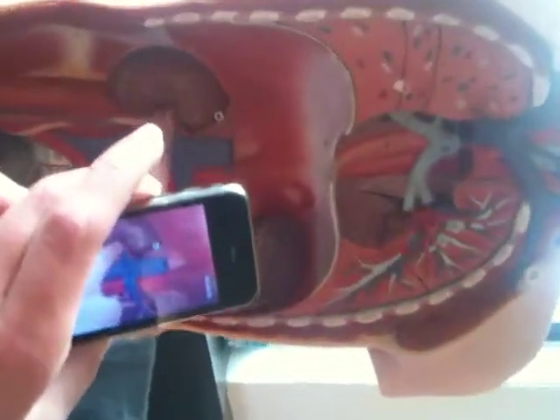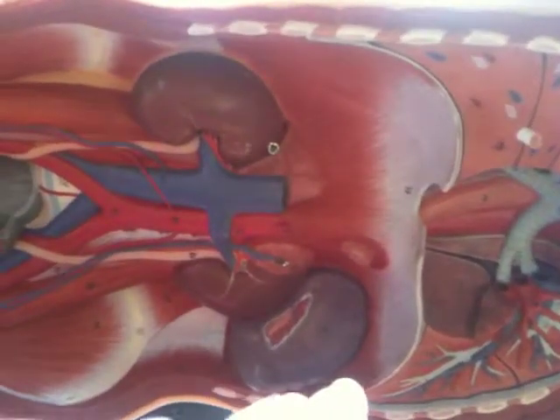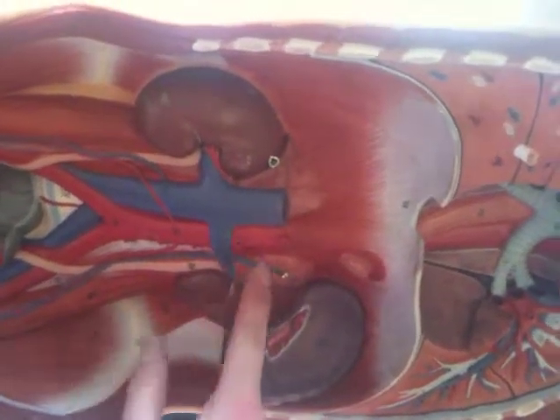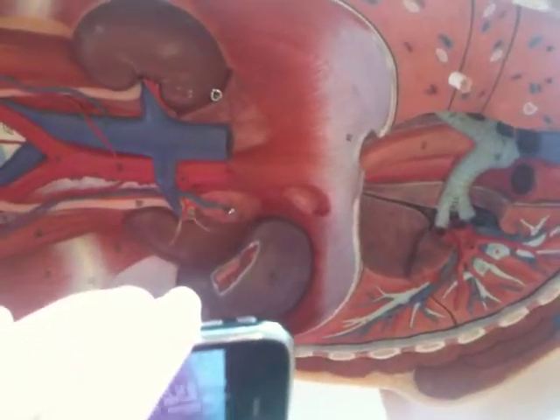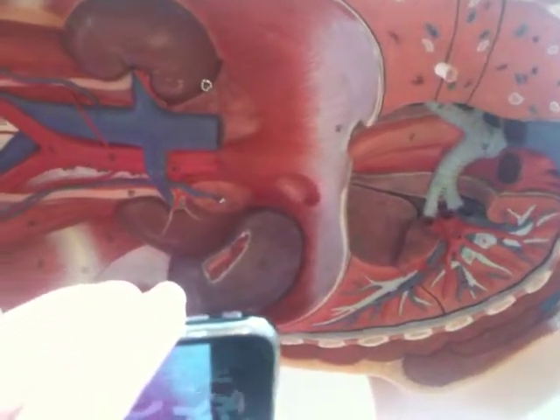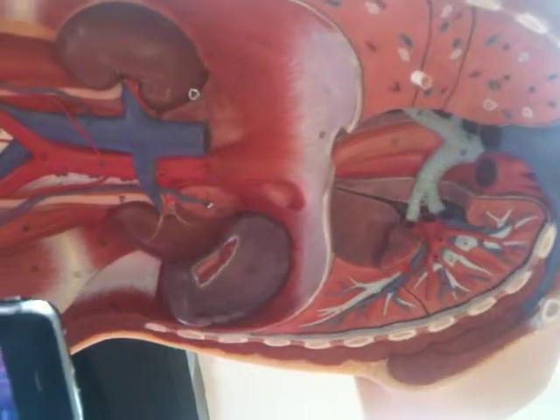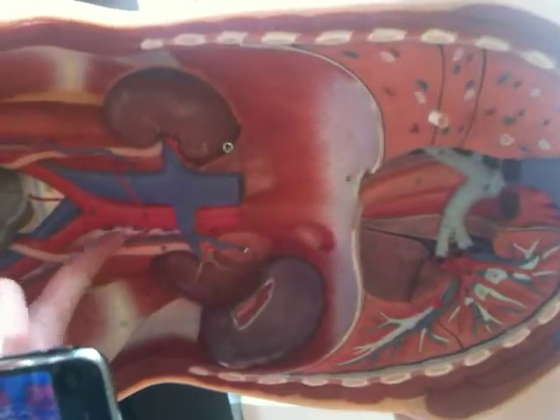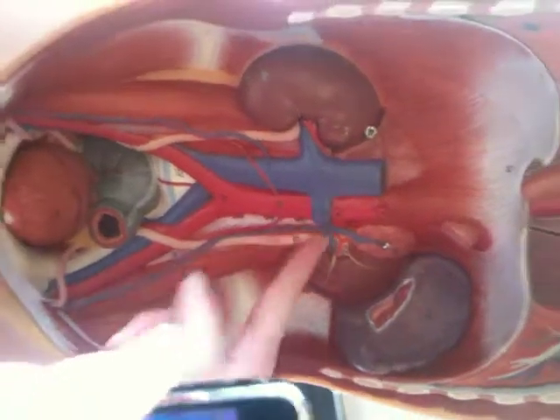So this would be the renal. The renal, yeah, and one here as well. So renal — it's suprarenal, it goes to the adrenal. Superrenal, which is adrenal vein. So renal vein and superrenal? Superrenal — it's the other word for adrenal. I wonder if you can intermix those words. No idea. Is that the gonadal vein down here? Because this is the gonadal artery. Yeah, that's kind of strange because it branches off. Maybe it just dunks right up in there.